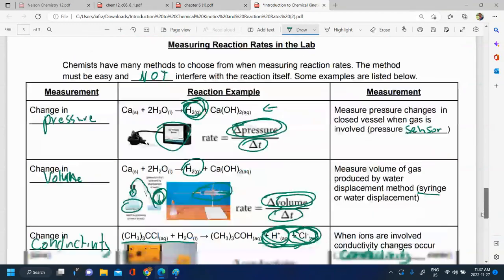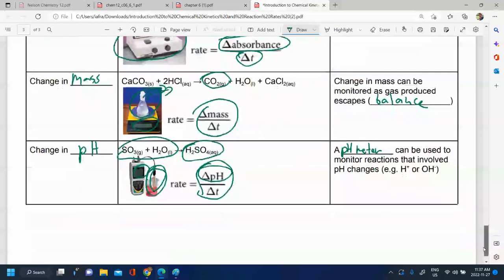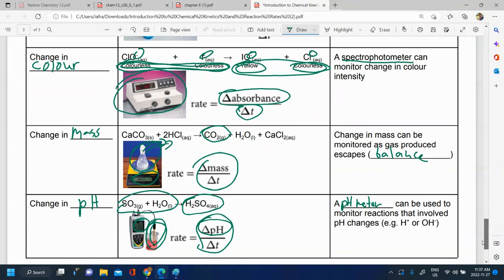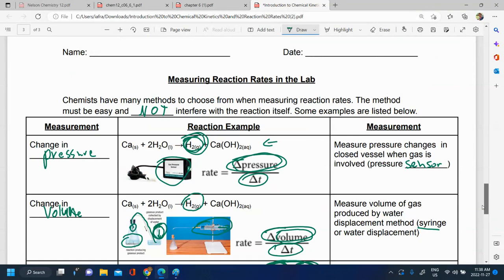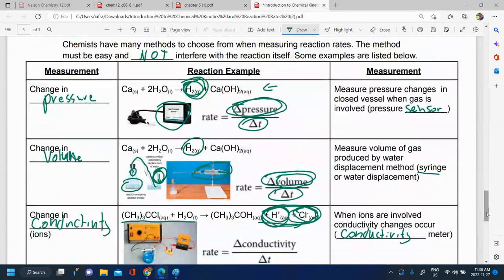There's other ways that you can monitor rates of reaction. So for example, maybe you might look at the change in temperature over time if you're dealing with endothermic, exothermic style reactions. It just depends on the reaction that you're looking at. Your goal right now is to be able to explain the main ways we discussed here, to perhaps select the most appropriate measurement for a specific reaction.